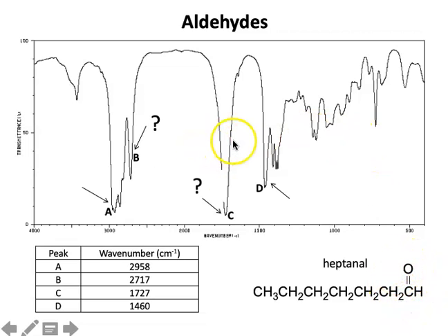And so that's really the only super interesting thing that you see here, even though you might see all kinds of different arrows pointing at different things. If we had already been through an organic chemistry class and were coming back for advanced organic, we'd spend more time talking about these peaks, but I really don't care about them.